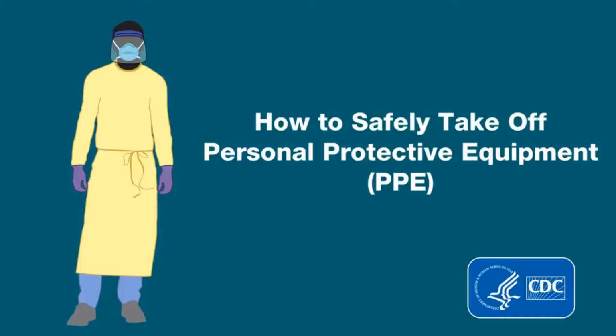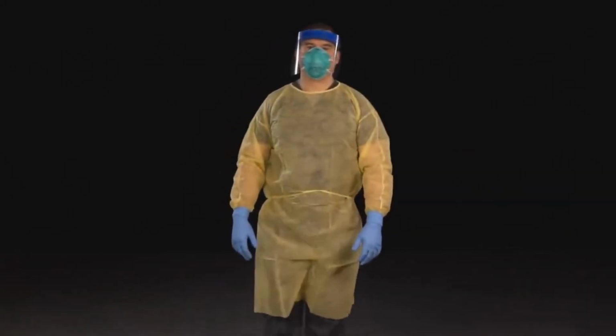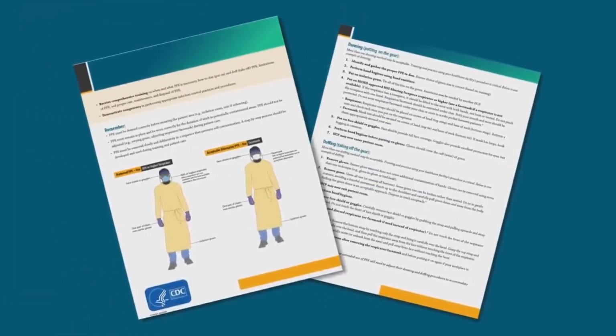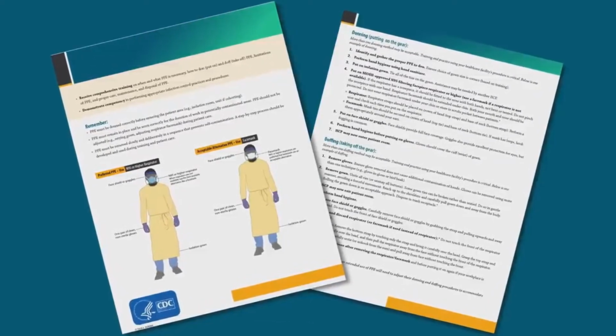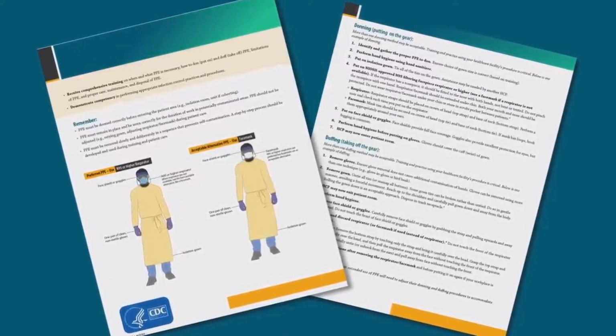How to safely take off personal protective equipment, more commonly called PPE. We will demonstrate one way to appropriately take off or doff PPE. More than one doffing method may be acceptable to your facility. It's important that you receive training, demonstrate competency in removing your PPE without contaminating yourself, and practice your healthcare facility's doffing procedure.